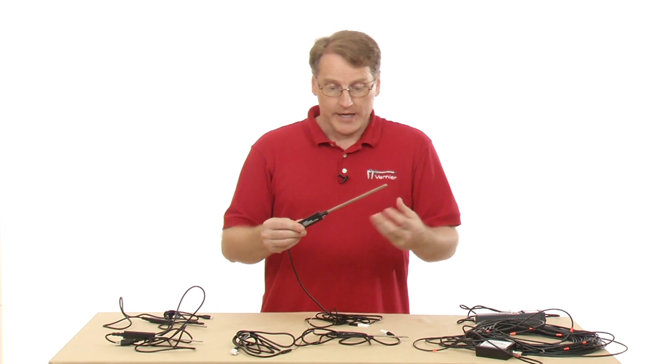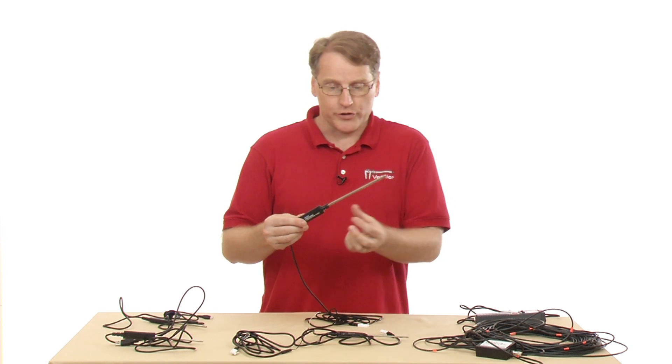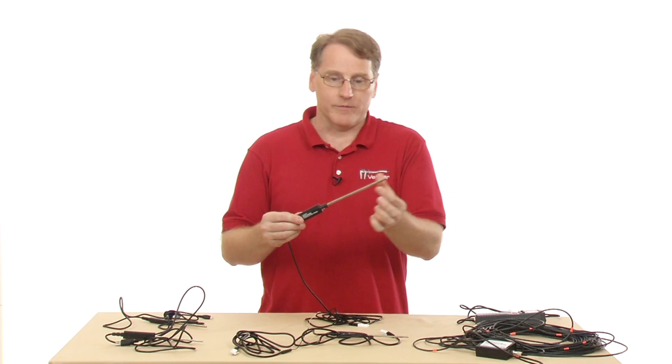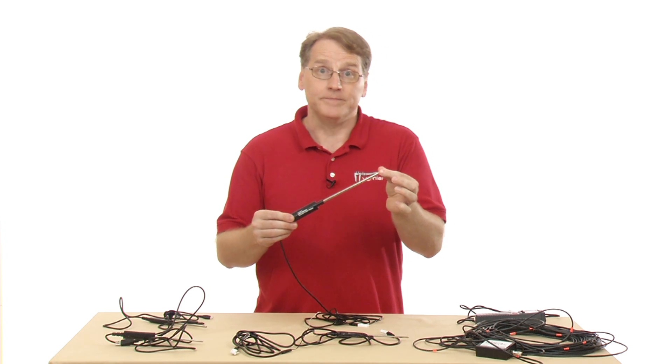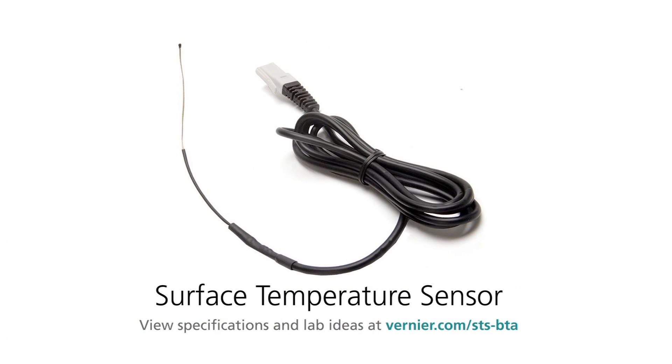This one can do this. It's also, obviously, physically larger, and it's designed to have the same size shaft as a standard alcohol thermometer.